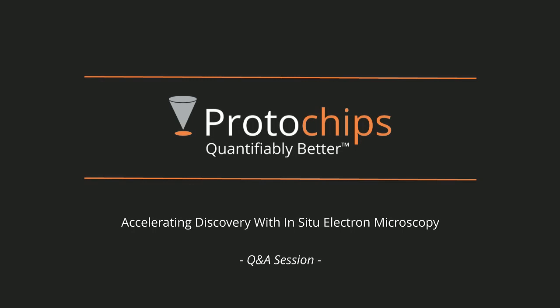But of course, a lot of people want to be able to mass produce this if you wanted to create functional 1D and 2D heterostructures. One way you can do that is using a larger scale, like a factory of electron beams, and maybe even multiple electron beams. But in the example that I showed you, if you take these materials that are not irradiated by the electron beam and thermally expose them in vacuum at elevated temperatures, you can create the same type of edge structures that you've seen here. So that could be a nice way to mass produce these types of materials. And then once you've done that, you can do the standard transfer processes to actually create these nanostructure devices from their substrate.